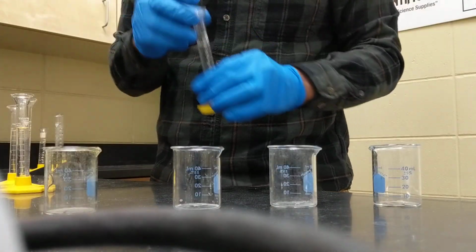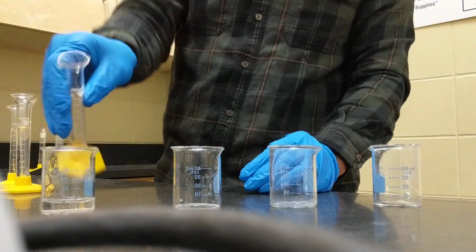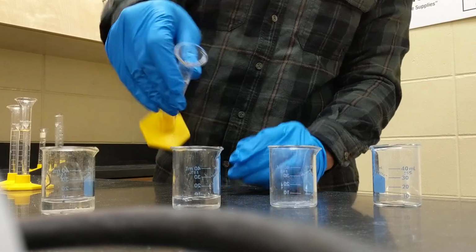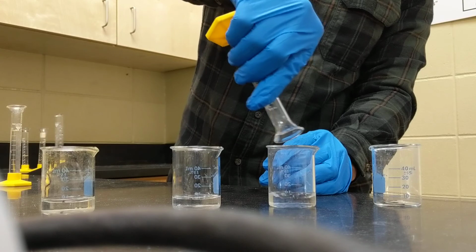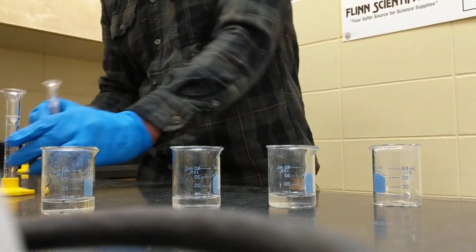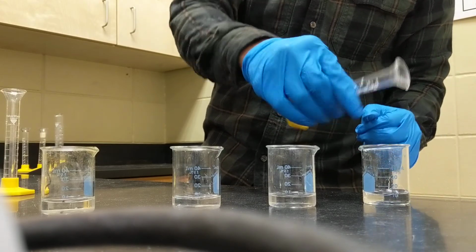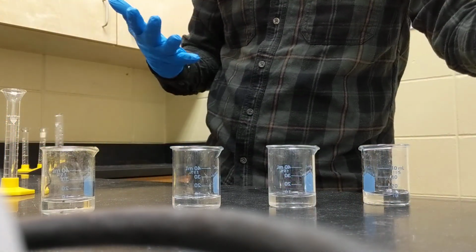In this reaction, we're going to take a known amount and concentration of our hydrochloric acid, and I've already measured out 10 milliliters, and I'm going to place that in each of these small beakers. In the beakers, before actually adding the solvent, I marked them with a Sharpie at the bottom. And in this reaction, what we're going to be looking for is the presence of precipitation formation, which in this case would be a solid sulfur component, which is a colloid.